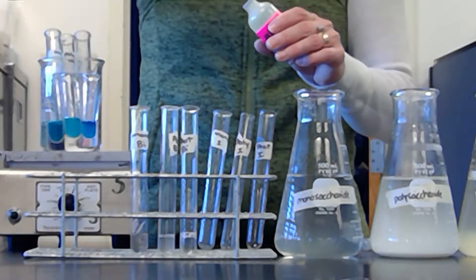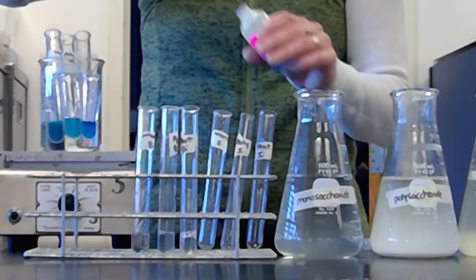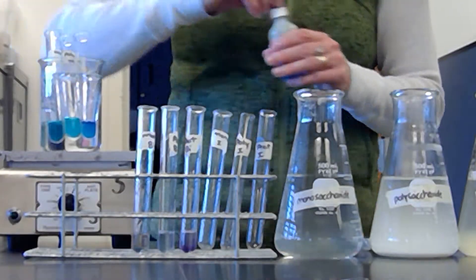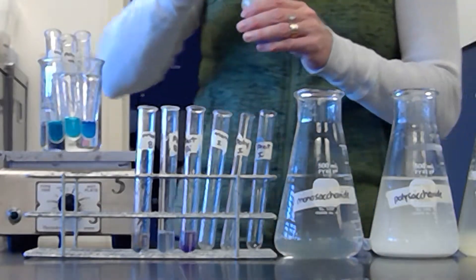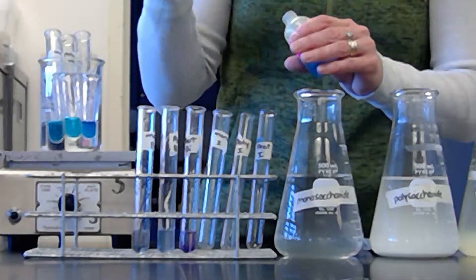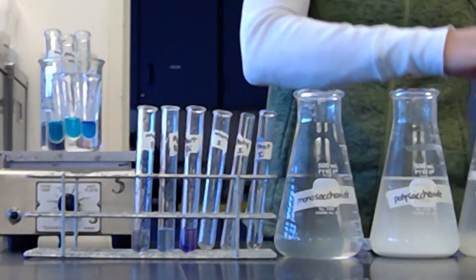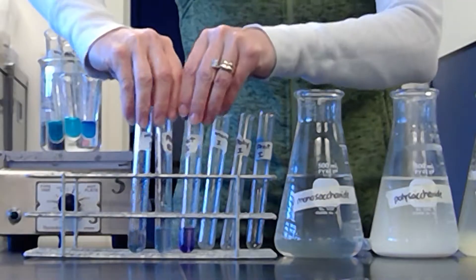So whenever you're looking for a change with any chemical reaction or any sort of change, you're going to look for a color change. And so I'll give this a squirt into the monosaccharides, a squirt into the polysaccharides, and then a squirt into the proteins. I'm going to give them two squirts just because then you can see a little bit better.